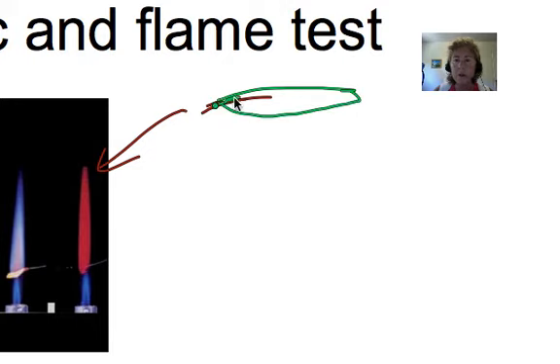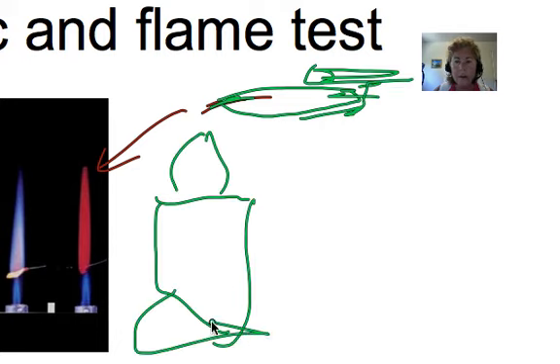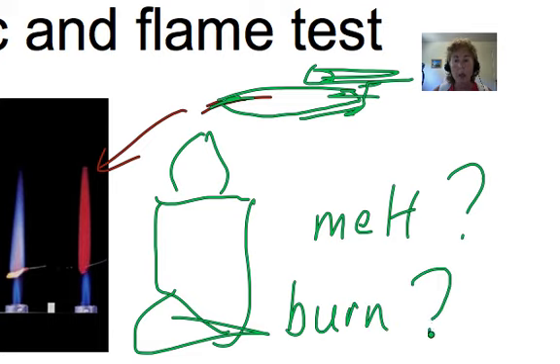We're going to take the tweezers. You're going to hold it with your fingers really gently. Put it over this flame. And with the flame here, you're going to see what happens to each of the fabric. We have cotton, acrylic, and something else that you need to find out. And we're going to determine, does this fabric melt? Does this fabric burn? In other words, flame.